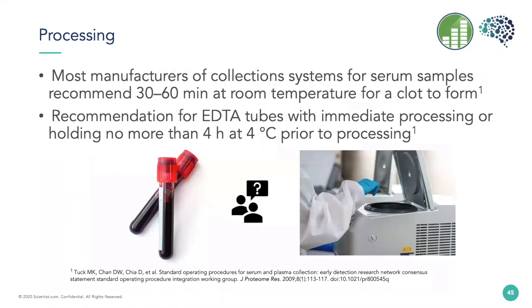So finally, in processing, it's its own timing challenge. So serum samples that are allowed to sit less than 30 minutes are likely to retain some cellular elements and other contaminants that are going to impact your future analysis. Samples that sit over 60 minutes are likely to experience lysis of the cells in the clot, and that's going to release cellular components that you shouldn't be able to find in your serum samples.